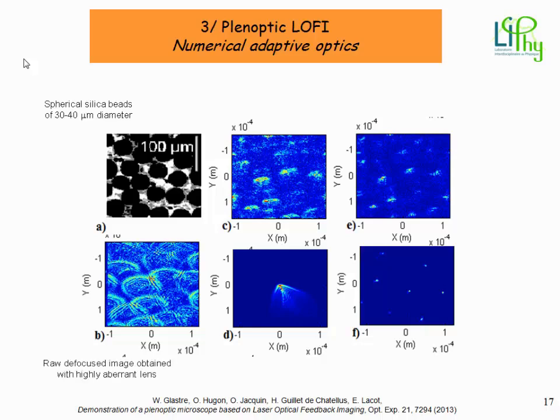So here is the target, the blurred acquired image obtained with the defocused laser beam. From this image, firstly, the defocus is removed, which leads to figure C, where only the higher order aberrations remain. Then astigmatism and coma are removed, leading to figure E. This figure can be compared with this one, which is an image of another part of the target obtained with the lens without any aberration.